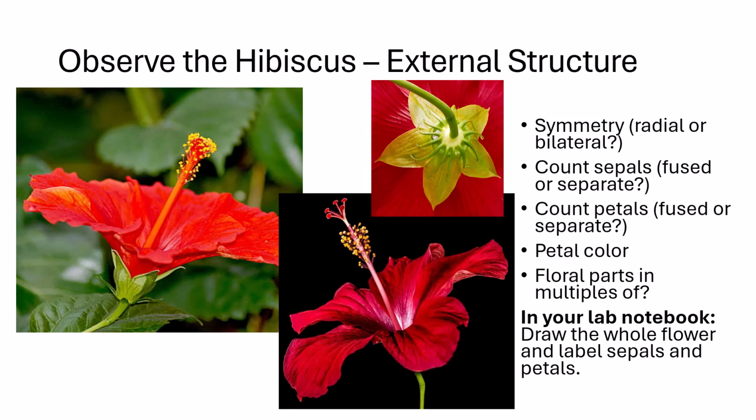Now draw the entire flower in your lab notebook. Label the sepals and petals. Focus on structural clarity, not artistic perfection. Pause and complete your sketch.